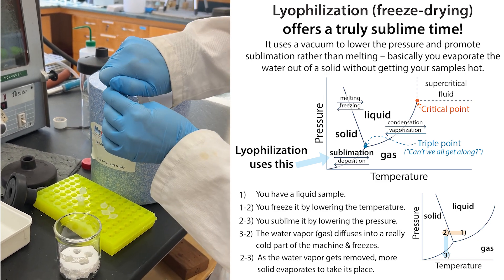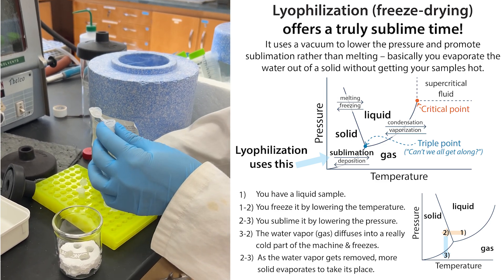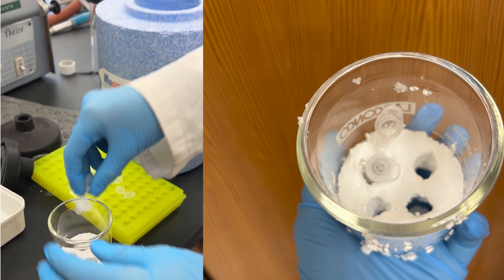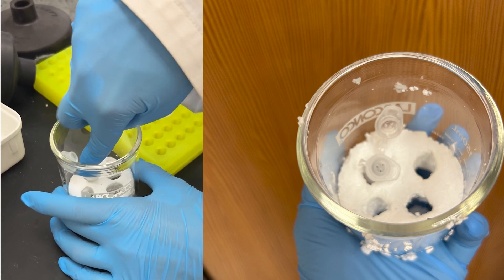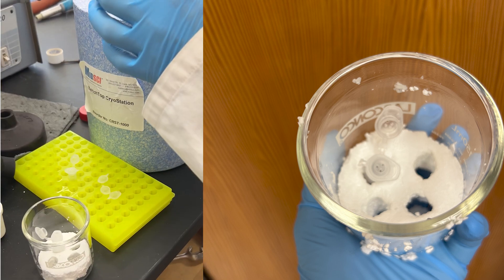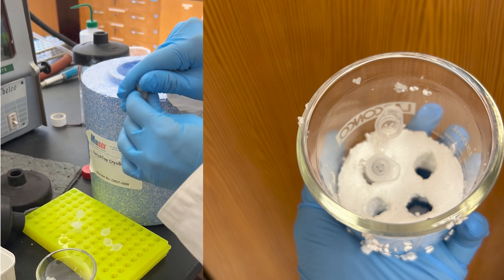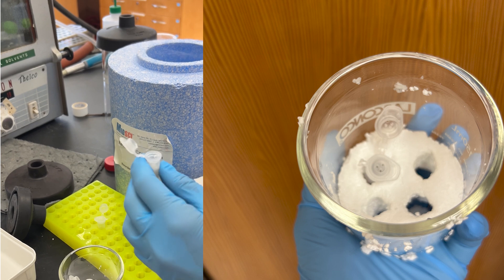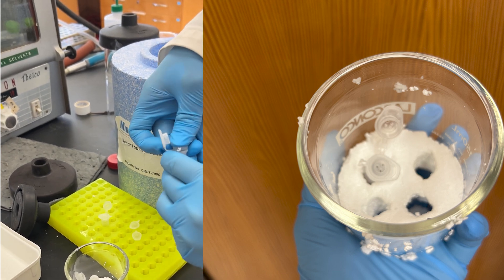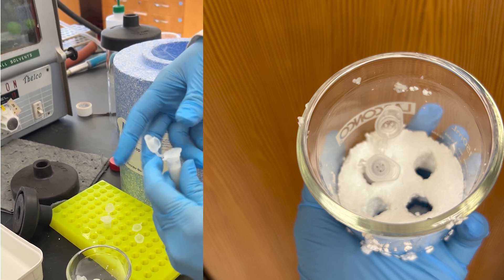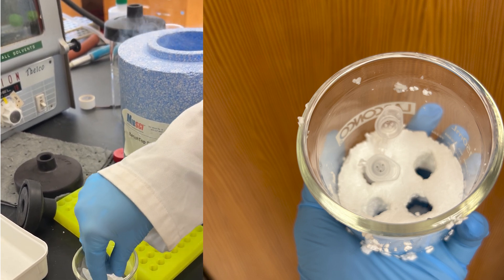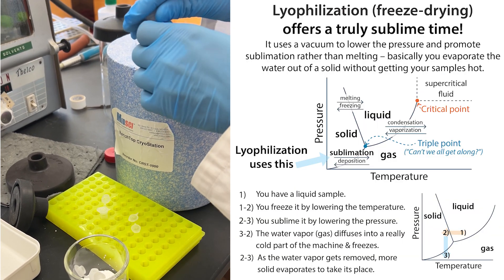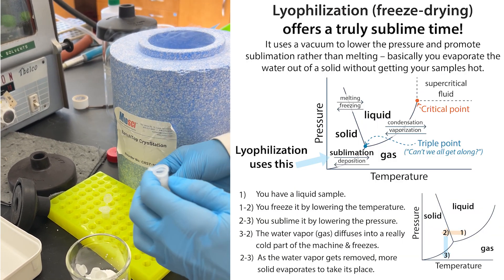So we open the lid of the frozen tube, stick on the cap with the holes, and stick it in the little styrofoam holder. We do this for all four. We want to make sure we have the hole cap so that the water vapor can escape once it sublimes off, but we keep the normal caps too because we'll use these tubes later.